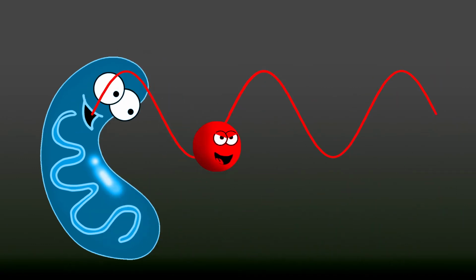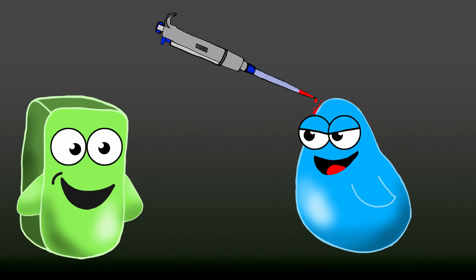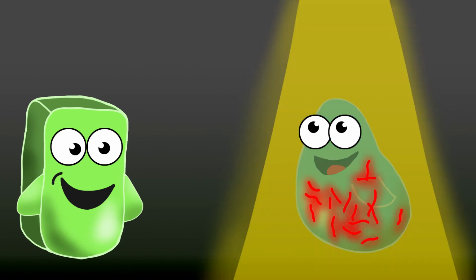You got it. Okay, so let me see if I got this right. With confocal microscopes, you make your sample fluorescent and then use lasers to get an image so you can see organelles and other structures. Does this only work with those stains you mentioned?